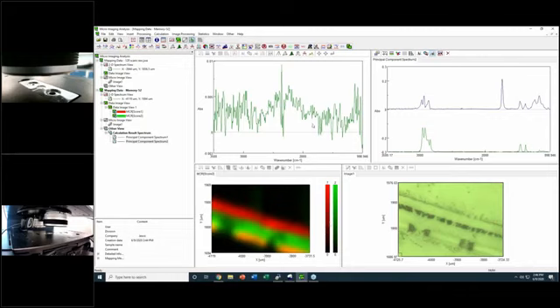So with that, this is what I have prepared for today. It was almost 45 minutes. I hope that we now have the session open for discussion.